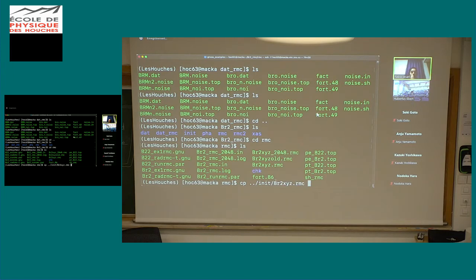This file we created before with Cremol RMC, copied from that folder to here.